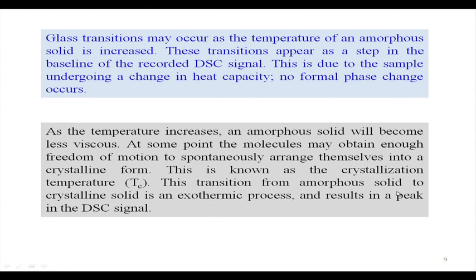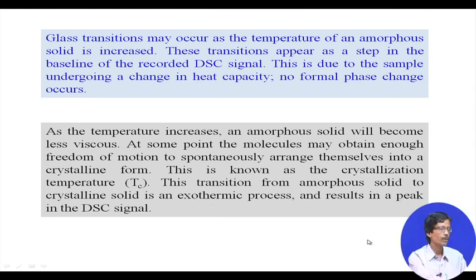We get the change from the amorphous solid to the crystalline solid, because most of the time when you synthesize some new compound, whether in room temperature stirring condition or in some high temperature refluxing condition at the boiling point of the solvent, when we cool it down to room temperature or stop the stirring, we sometimes get a crystalline solid compound, but in all other cases we get some amorphous solid.